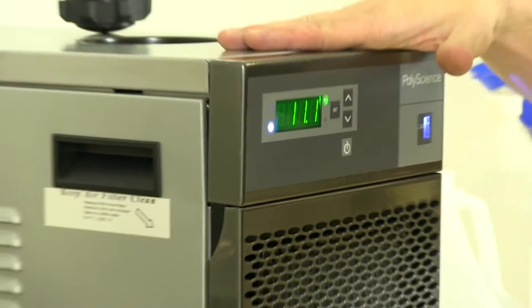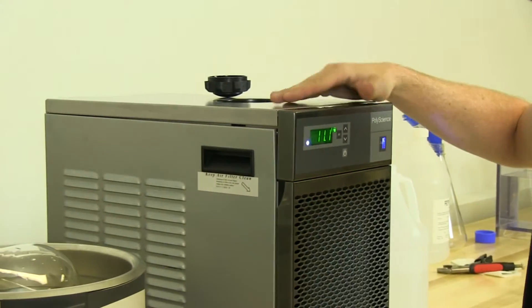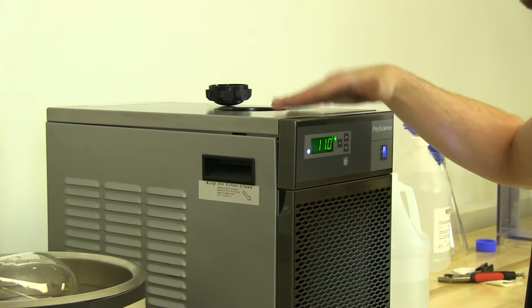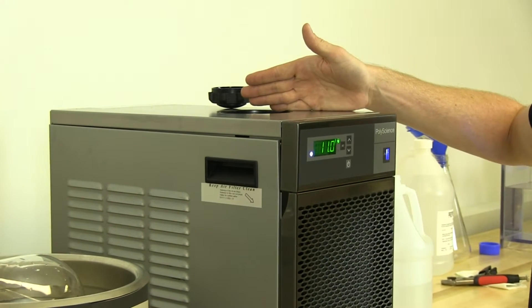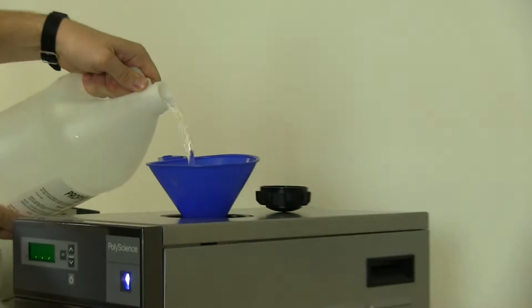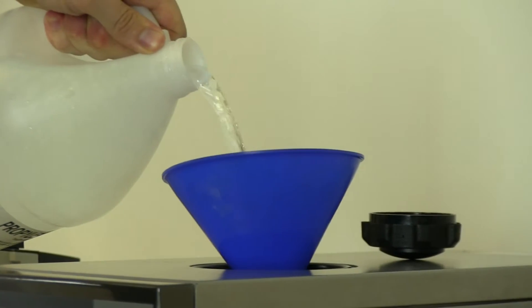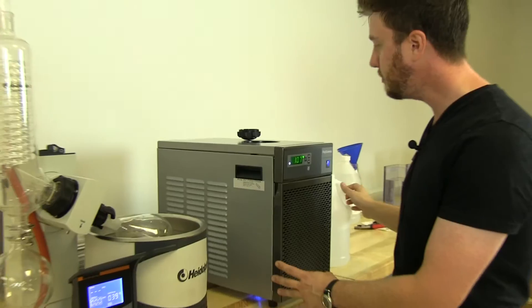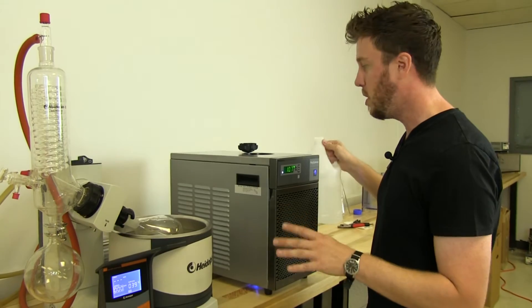Now, filling the PolyScience LM6 mini chiller is rather simple. We use propylene glycol, we pour that in here gently with a funnel, and then we top it off with water.